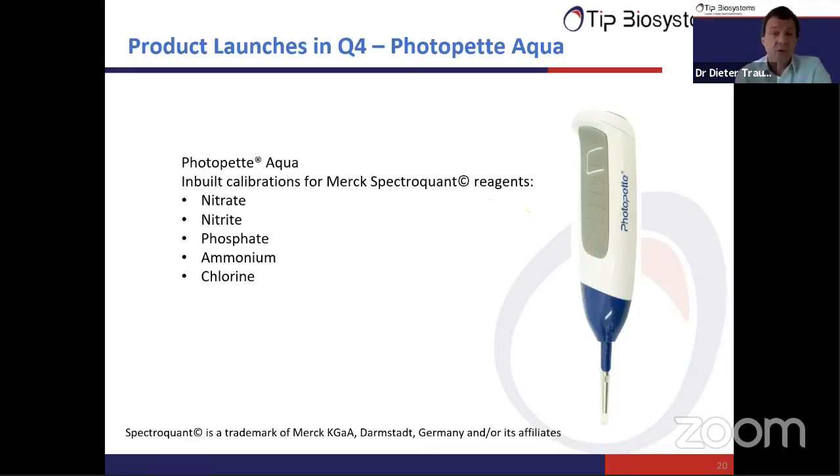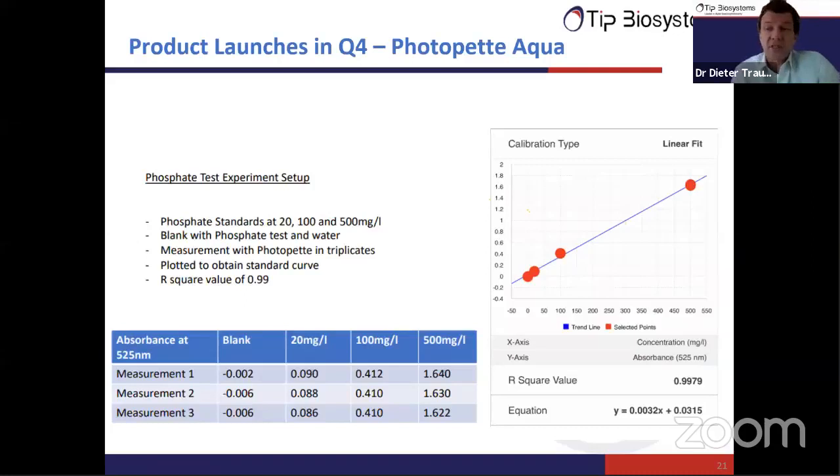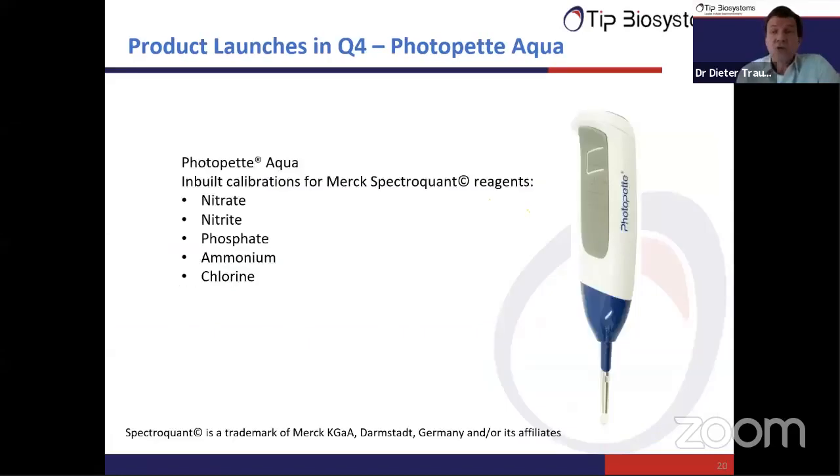We are doing now all the measurements, all the calibrations. And again, this instrument will have inbuilt calibrations for those analytes that you see here in the list. And this is a start. We may add more analytes later to this list.